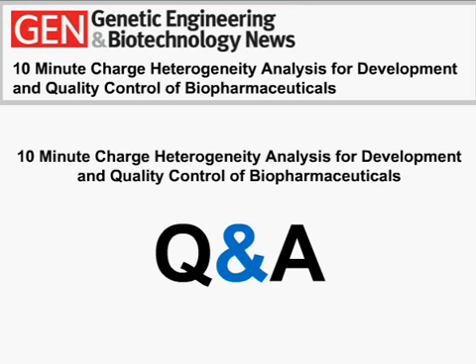Sure. The thing is, when we are dealing with antibody-drug conjugates, they are slightly more hydrophobic than just antibodies due to the attachment of the small molecules. So it is a challenge to keep them solubilized while they are focusing. And so what urea does is act as a mild denaturant and slightly opens up the conjugate molecule and exposes the charge of the conjugate better, which helps to separate based on charge, and you see this good resolution. So that is why we found urea to be really helpful, especially in cases of conjugates.